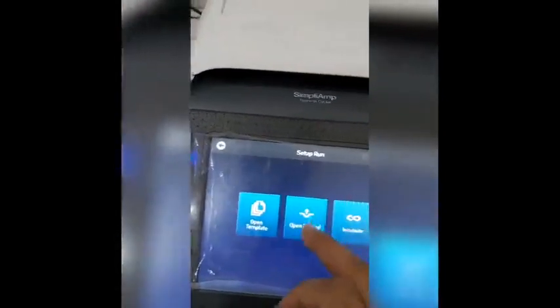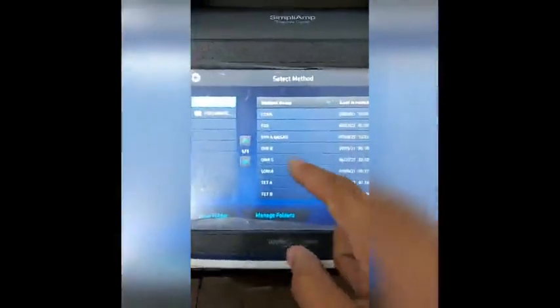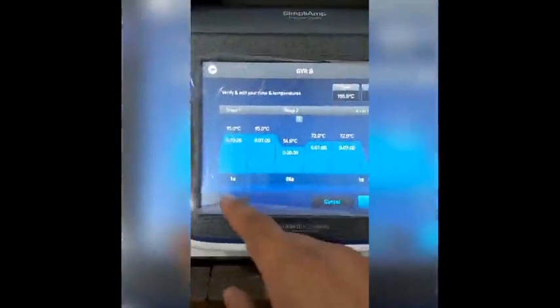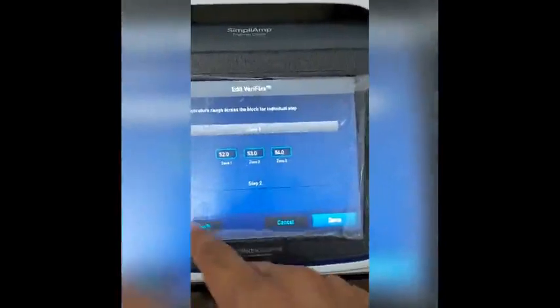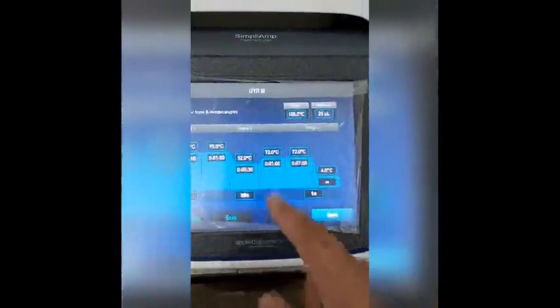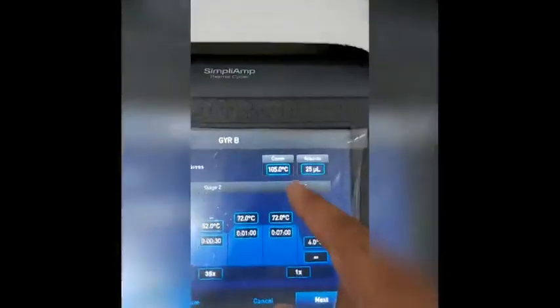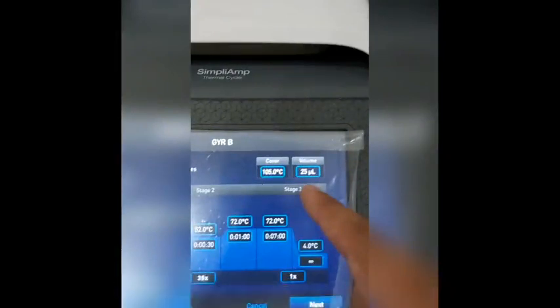In the normal PCR mode, when you already know the optimum annealing temperature for your primers, you can use the normal method. In that case, you turn off the variflex option, so the temperature will be the same across all three blocks of the PCR machine. For example, if it is set to 52 degrees centigrade, all blocks operate at 52°C, with a volume of 25 microliters and a lid temperature of 105 degrees centigrade.